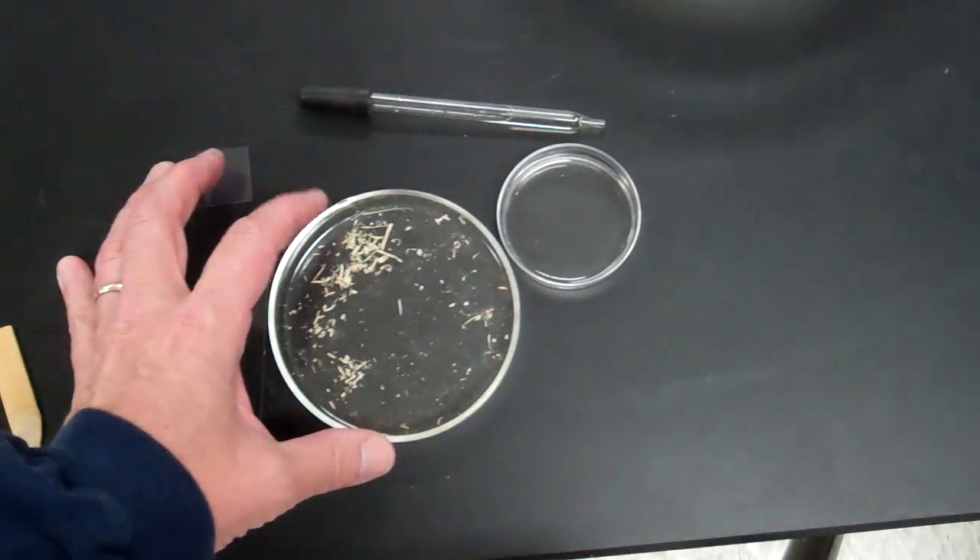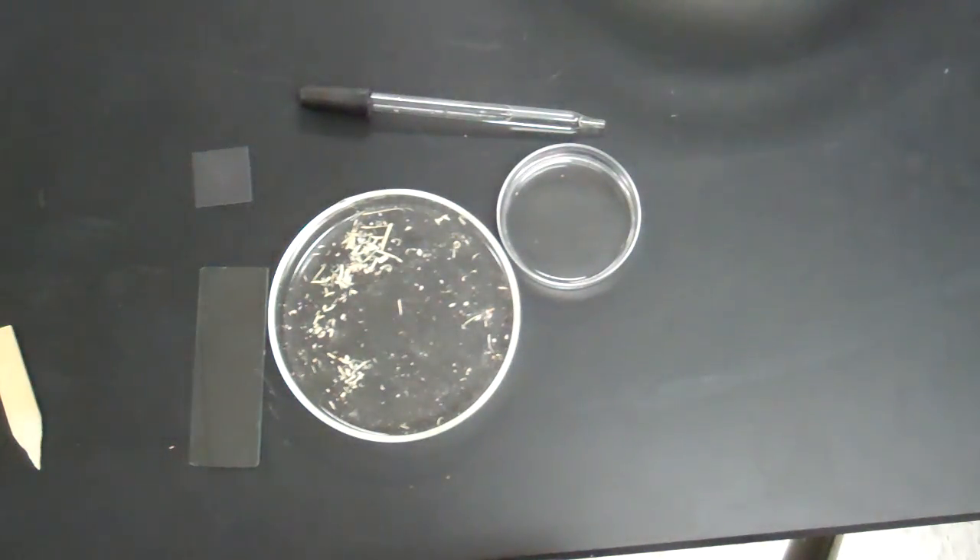Now bamboo is dried out, so all the cell parts are going to be missing except for the cell wall.